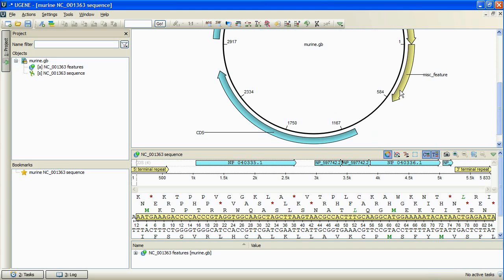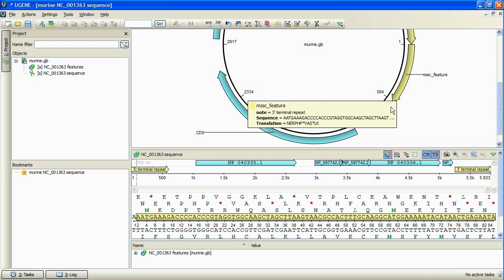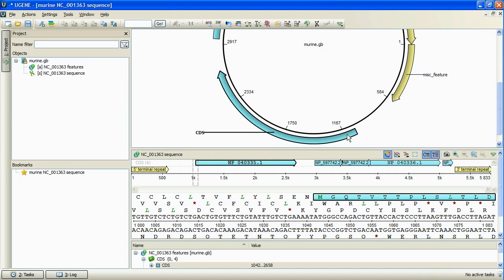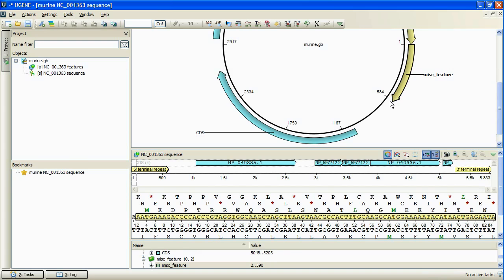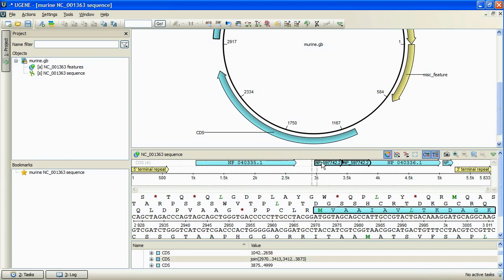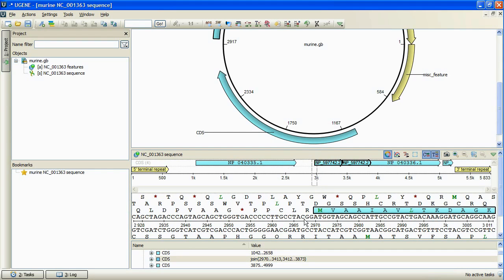The sequence annotations are represented as curved colored regions at the outer side of the circle. The circular view helps to navigate within a sequence. We can select an annotation by left click, and the annotation will be focused and highlighted in all three circular, panoramic, and annotation edited views.